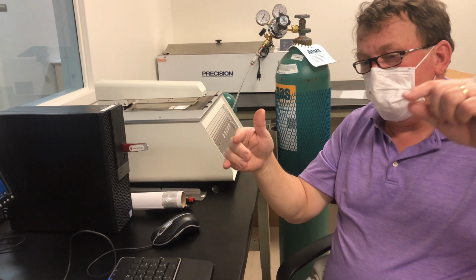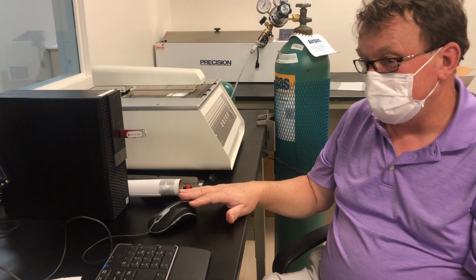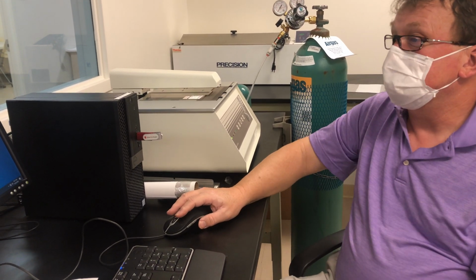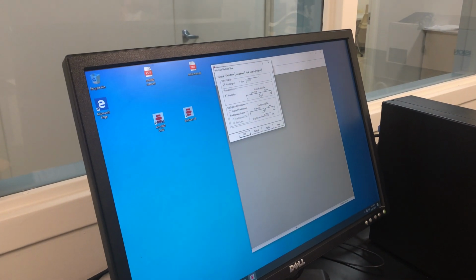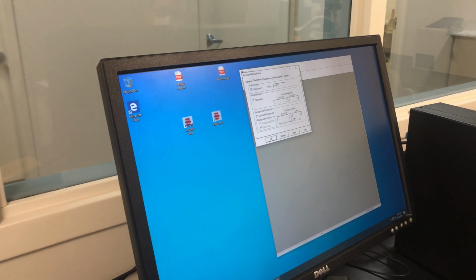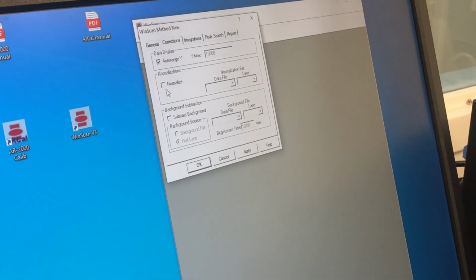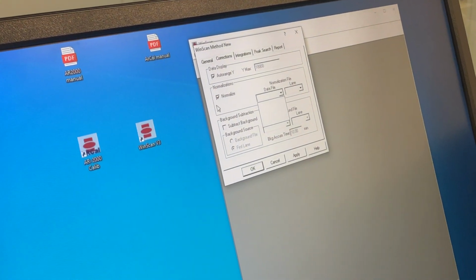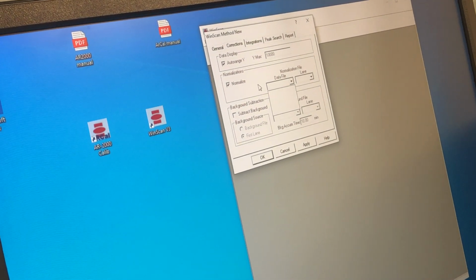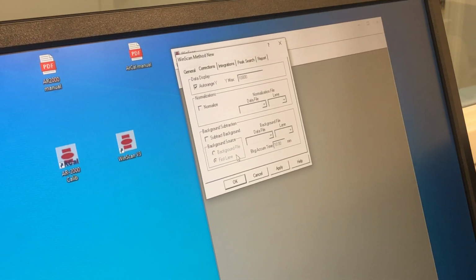So then you take your unknown sample, and it applies those correction factors to your unknown sample. So what you do is you periodically make a normalization file, so you acquire this in your method. Okay, you acquire a normalization lane, and then you click on this, and you pick up the data file in the lane. Of course, we don't have any data yet, so I can't do that. That's what you do. But you don't have to do that.